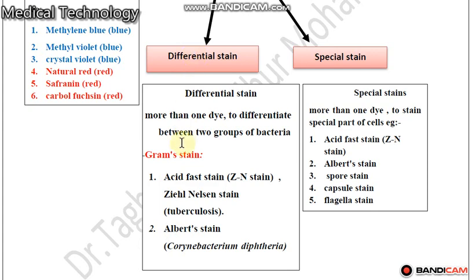Differential stain, for example, gram stain. Special stain, for example, spore stain, capsule stain, flagella stain, etc.